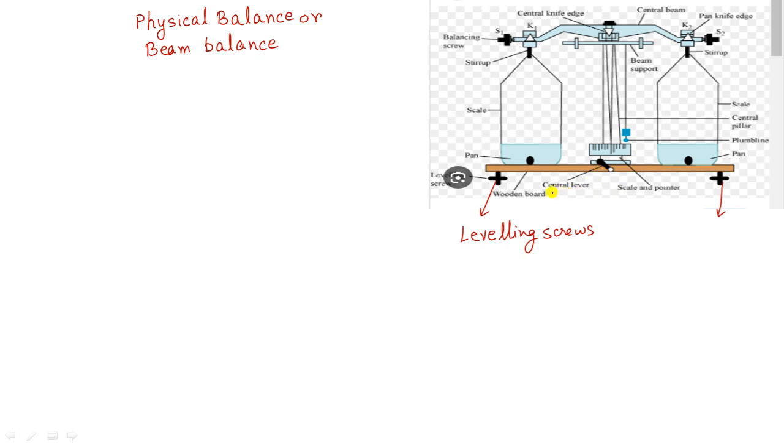The next one is the wooden board. There is also the center lever. When you rotate this lever, you see there is a beam support here. The beam support will raise the physical balance such that it is free to move upward or downward. When you rotate the center lever it moves up and the balance is free to move up and down.